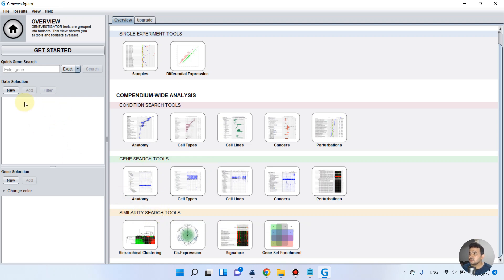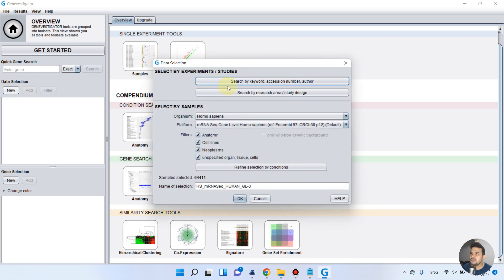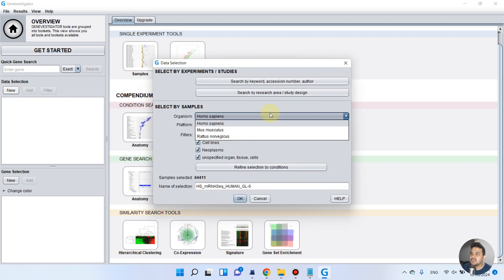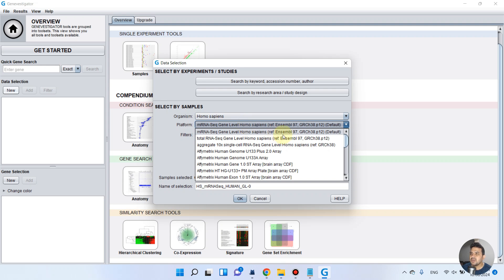First we need to select our database, which will run in the background of this software. You can download it from the Gene Investigator website. This is the data selection step — first we need to select our organism. Since we are working on human beings, we will select Homo sapiens, and as you can see we have different platforms.